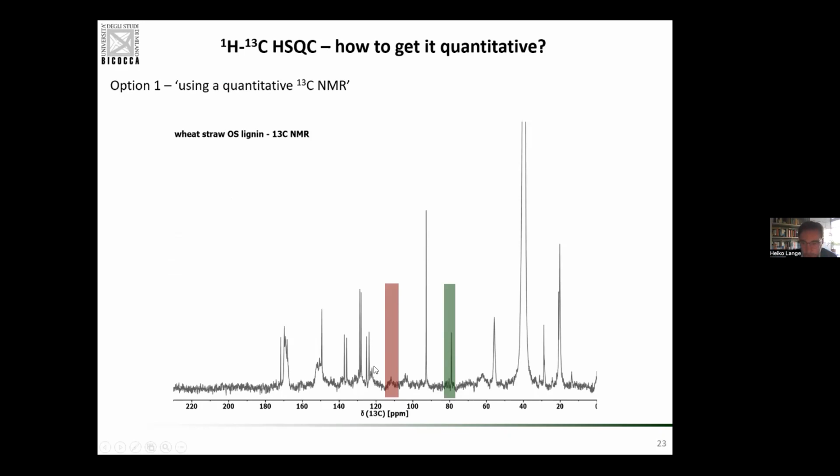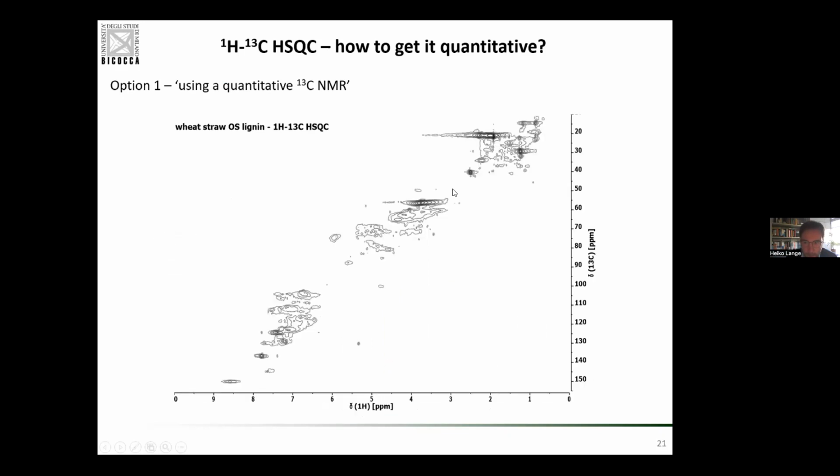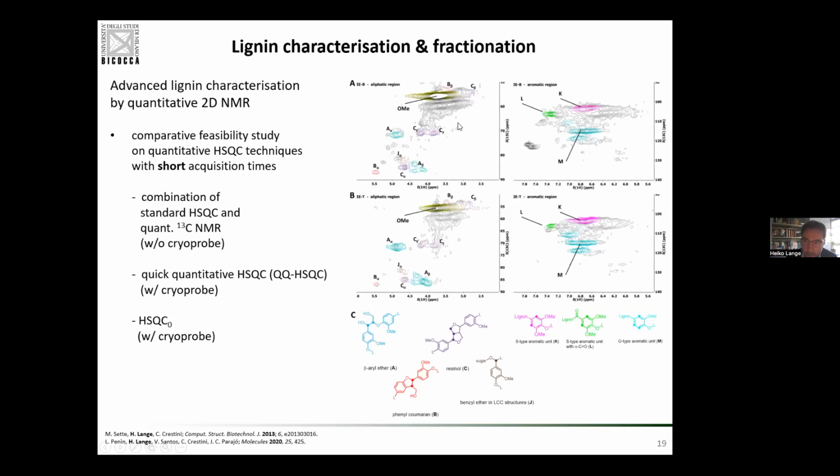So what is the aliphatic and what is the aromatic region? So here in the upper right, we have the aliphatics. Here we have the so-called anomeric region. And normally, if you see people plotting spectra, as I did here, you see that people plot the aliphatic region up to 5.5 here, where you enter the anomeric region, and then you put the aromatic region.